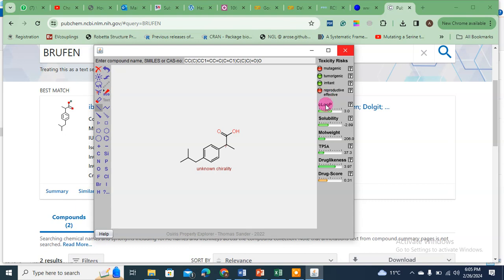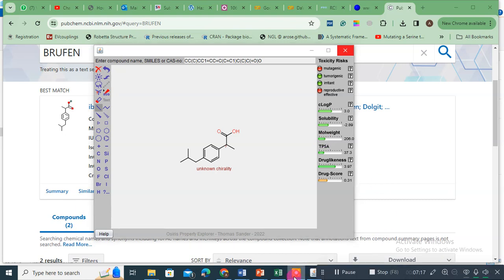Ibuprofen has two problems: it is mutagenic and it has reproductive effects. Now, the chemistry panels — cLogP, or the water-octanol partition coefficient: green means good, like a traffic light. Orange means not bad but not ideal either. cLogP is okay, solubility is okay, molecular weight is okay, TPSA is okay, drug likeness is okay, and the drug score is about 31% (0.31).